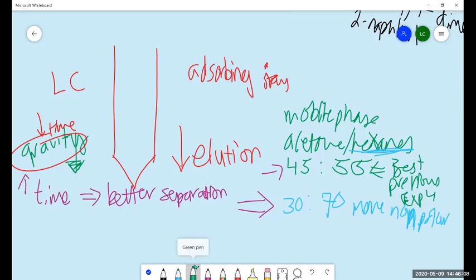Okay, so you might remember or recall you have your different components. You put a cotton plug down here because you don't want the samples, the sand, going through and all that. And then you have a whole layer.